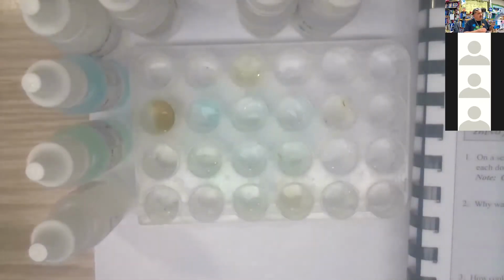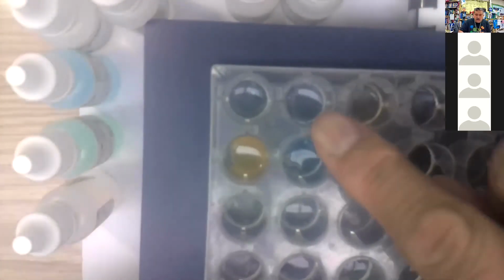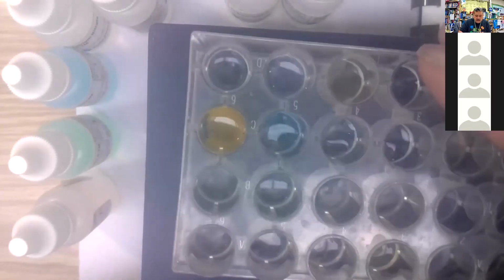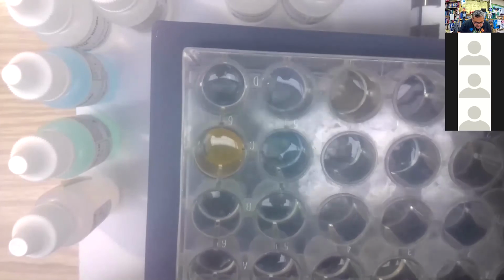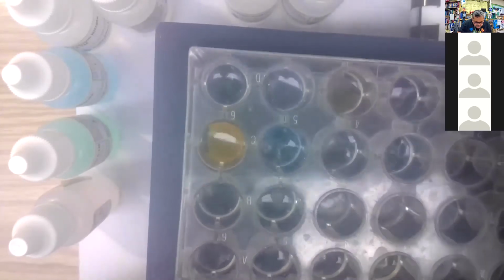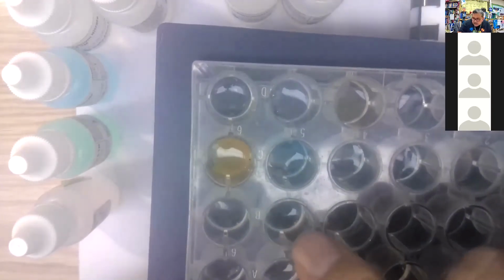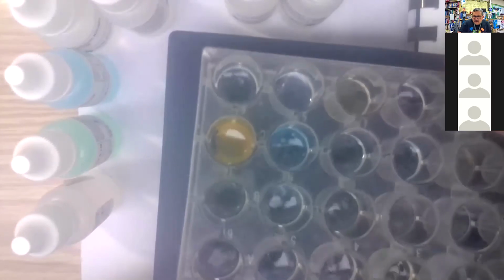Do we have any powdery precipitate? Then we're looking down in the second row. Nothing really there. Actually, this one right here does look like it had a little bit of powdery stuff.